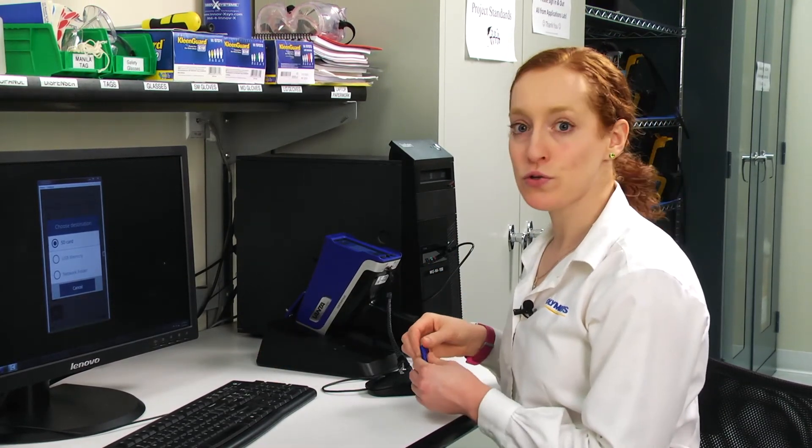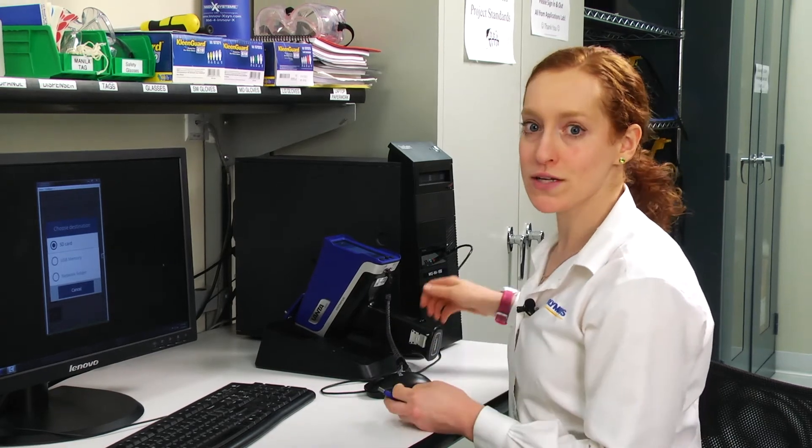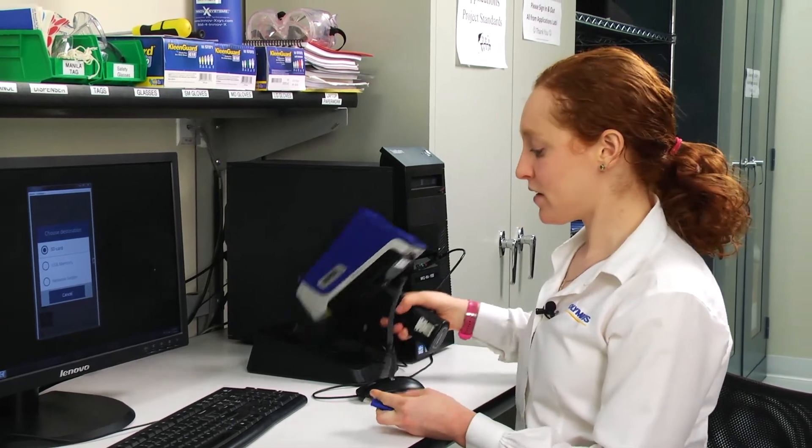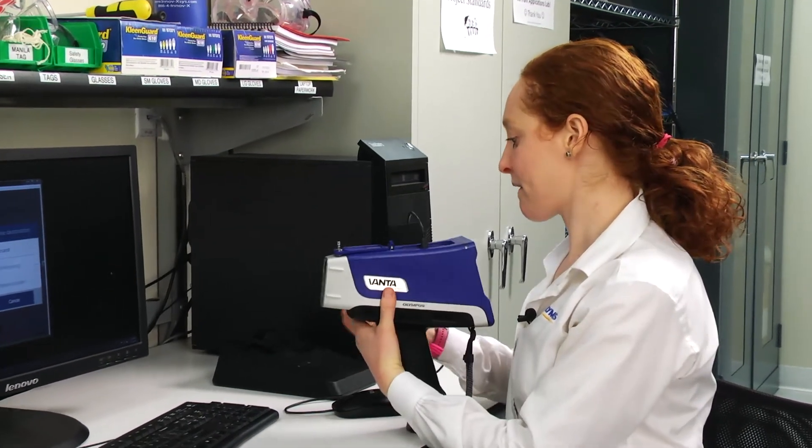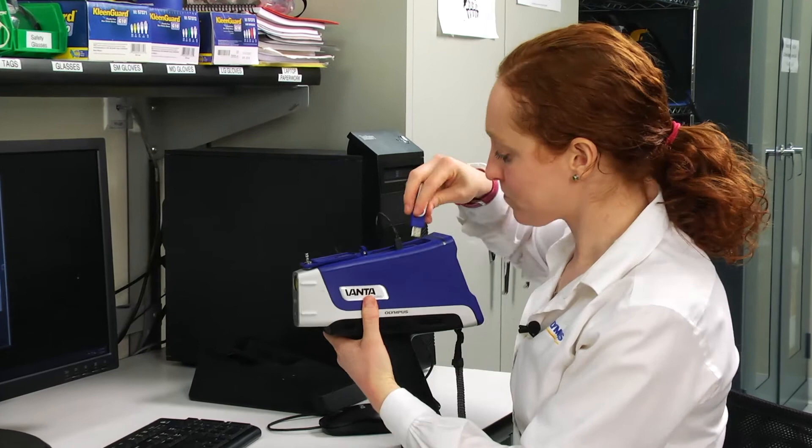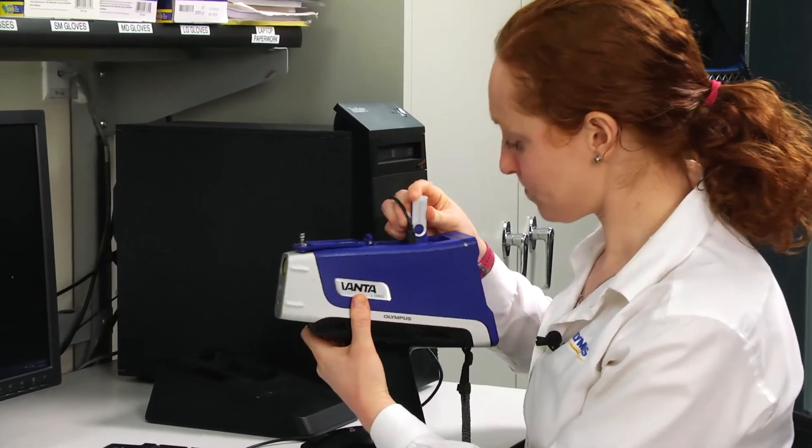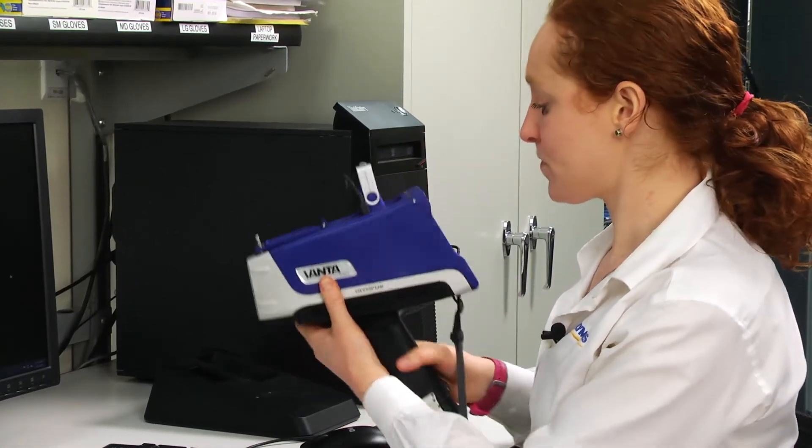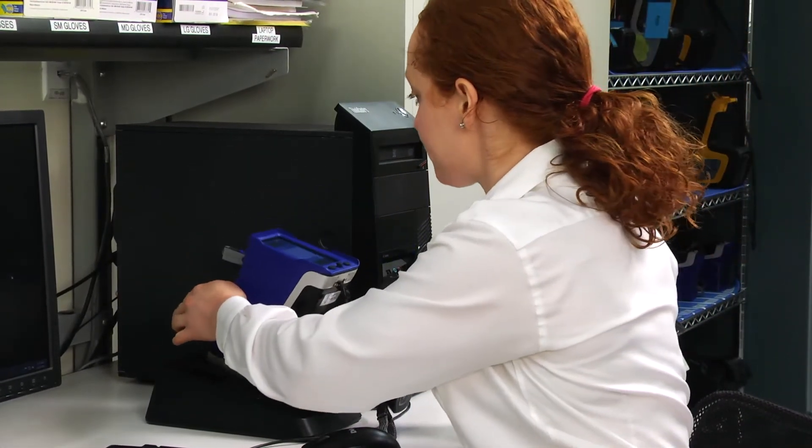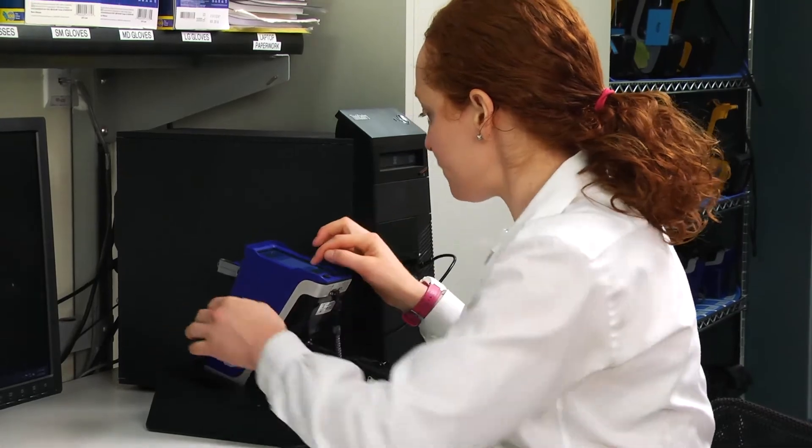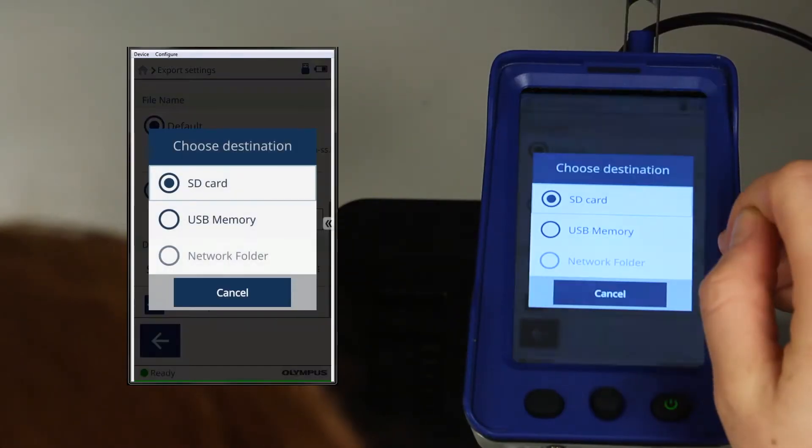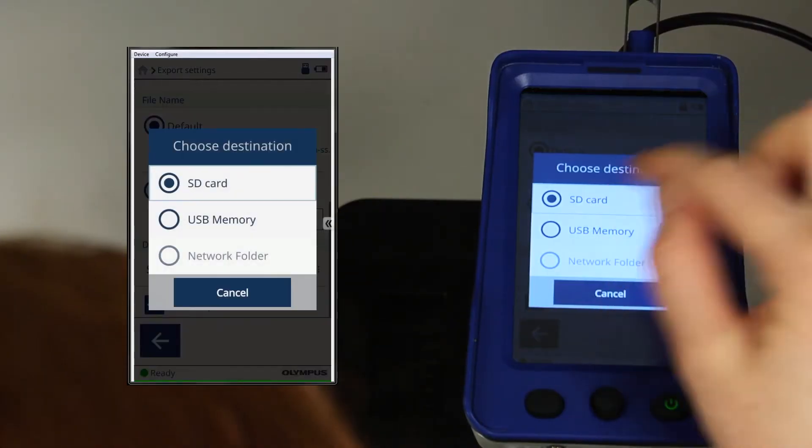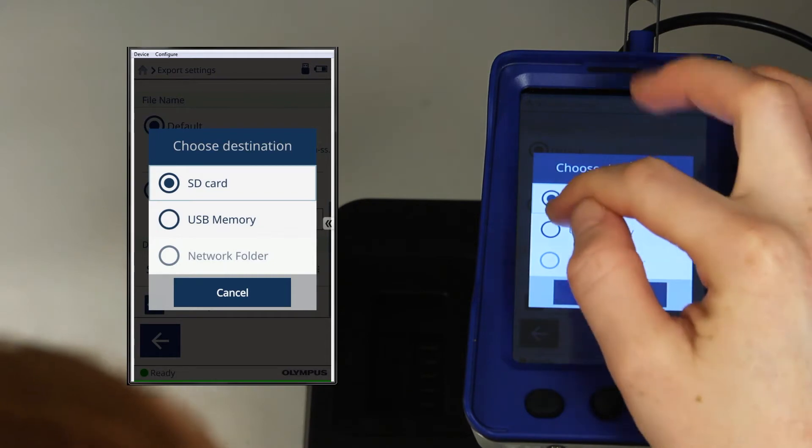To export to a USB memory stick, you must first insert the stick in the Vanta. Once you've done that, the USB memory option will become available.